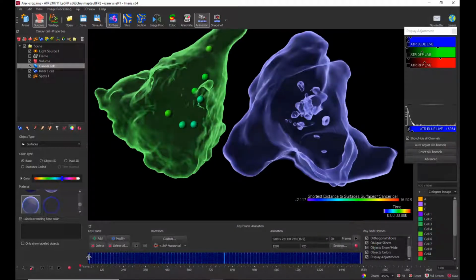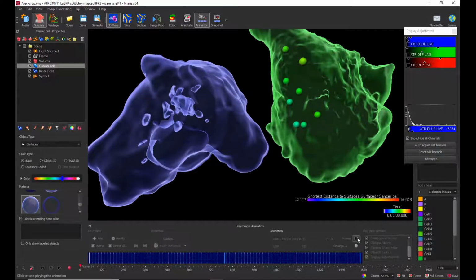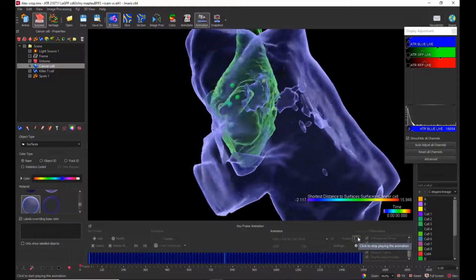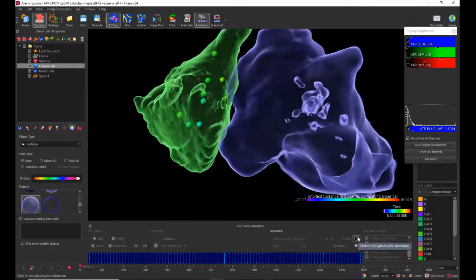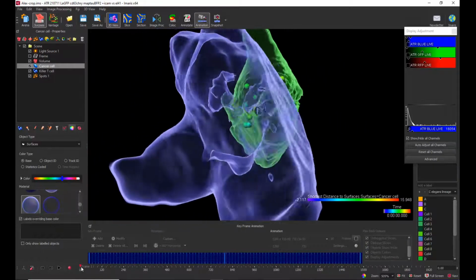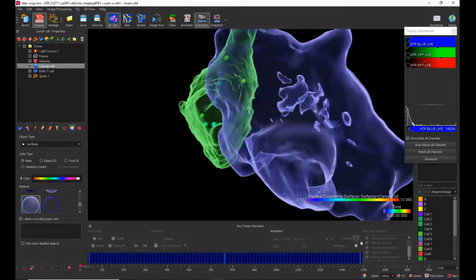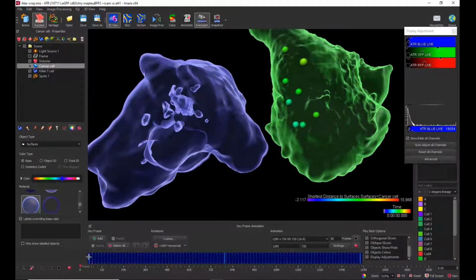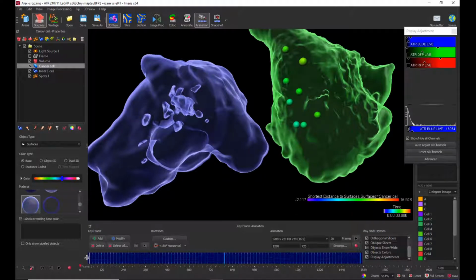So once I do the preview, there is a rotation, but a rotation of just a static image, so just the first frame. So you see that the frame here is all the time on the first position. So what to do to also animate the movement? So first position, first frame is okay.